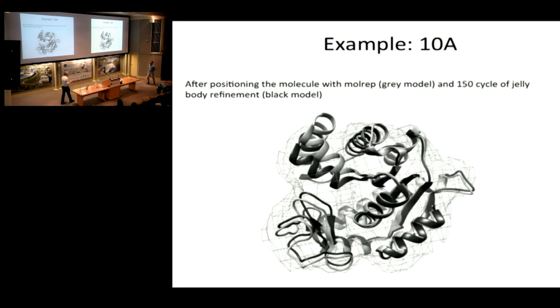Why do people want a number? Okay, let's say 5 angstrom. Today, 5 angstroms. I know you've published a study of a set of structures better than 4.5 angstroms, wasn't it? In-house, I guess you've looked at lower resolution. I think higher than 5 angstrom. Yes, that was not because it is optimal or there is a theoretical justification. That was because Alan Brown likes that number more than others.